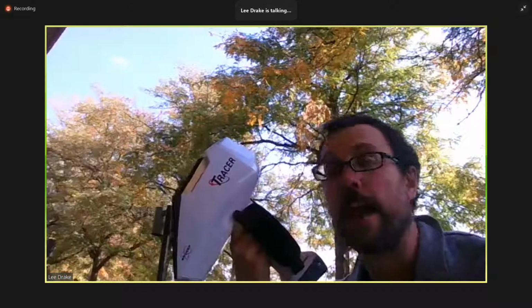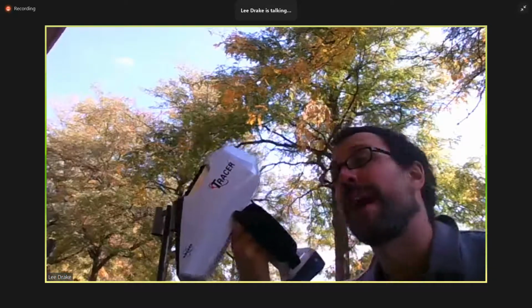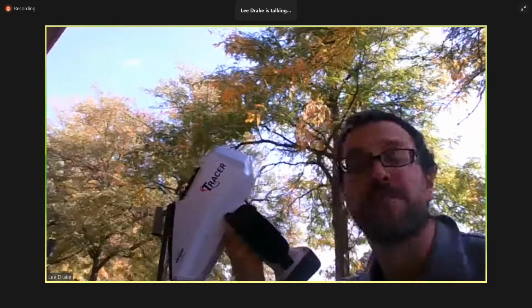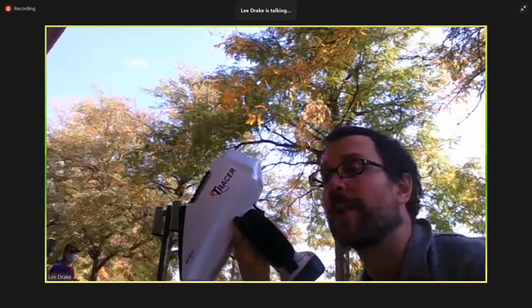Now, that said, as I've learned in my company, as I develop artificial intelligence to study it, that backscatter actually has a lot of information about the compositional properties of the sample. So it's not error, but it's also not easily interpretable. What we're typically focused on is the fluorescence peaks.